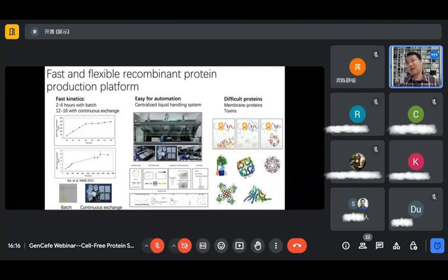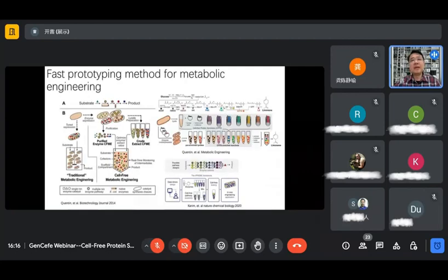And this is particularly used when you use cell-free techniques, so that you can play around or tune the hydrophobic environment, both from detergent or lipids, and the protein or detergent-lipid mixtures, and so on and so forth. I'm going to explain this later. And in another, I would not spend too much time on this topic.